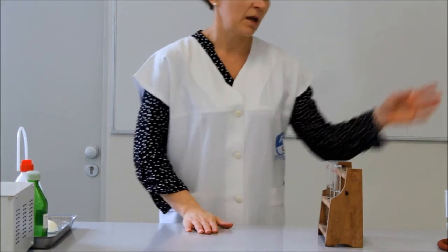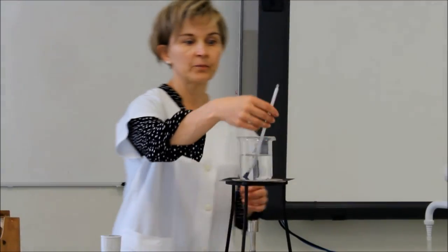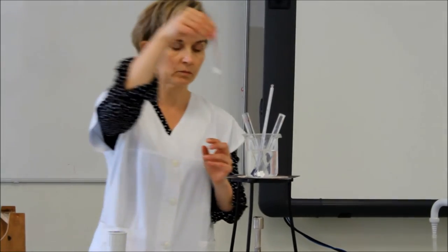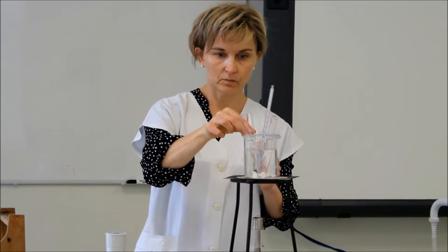Ezután a kémcsöveket a 37 fokos vízfürdőbe tesszük. A kísérlet eredményére 24 órát kell várni.